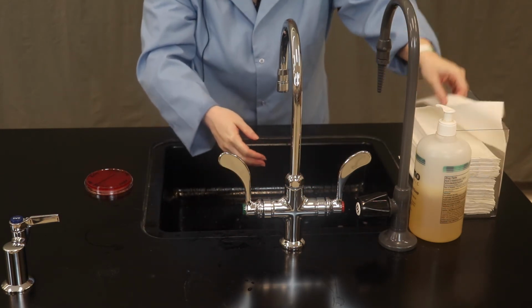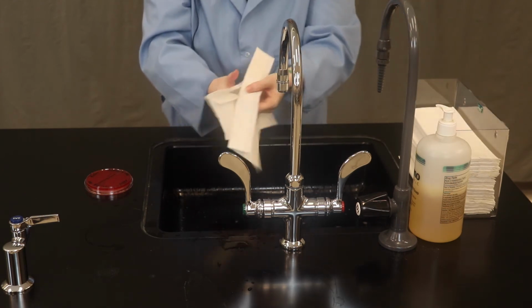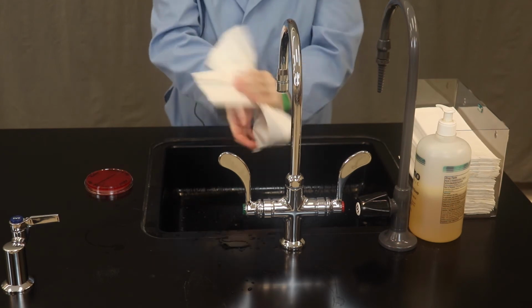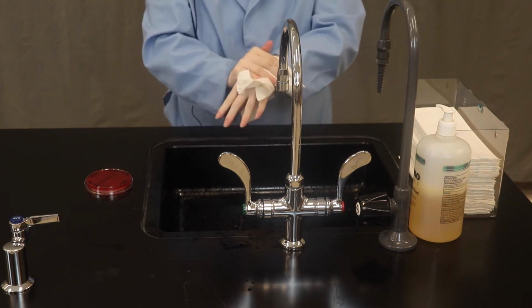Paper toweling has been shown to be really an effective part of hand washing. It further removes microbes from the skin and is quite useful.